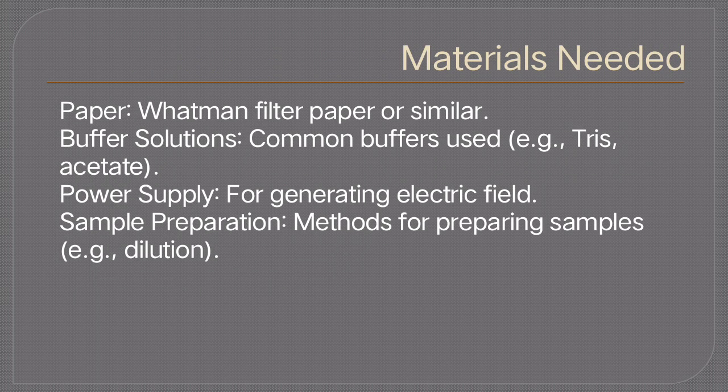Materials needed: paper, Whatman filter paper or similar. Buffer solution: a common buffer used, for example Tris acetate. Power supply: for generating the electric field. Sample preparation: method for preparing the sample, for example dilution.